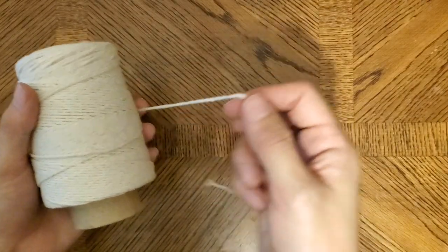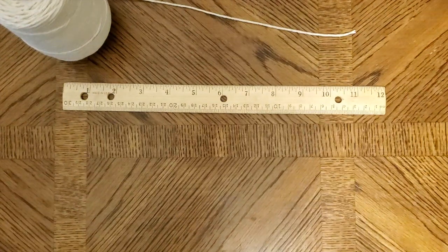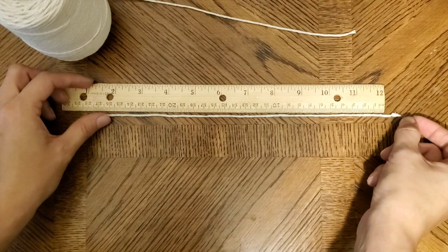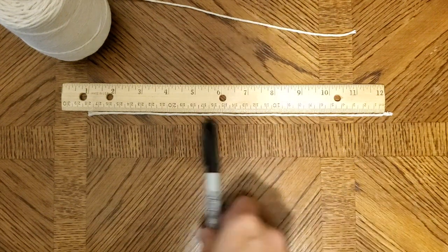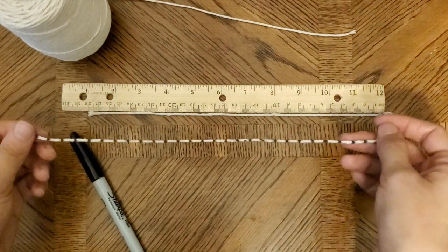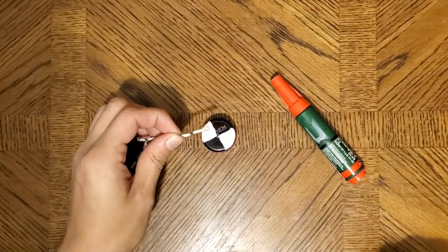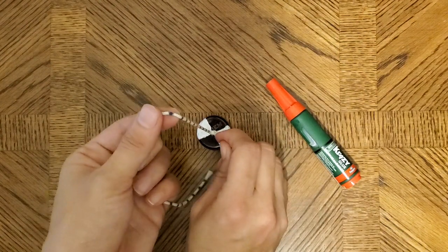Make sure that you ask an adult to help you with the gluing and that you're very careful. While the glue is drying, cut your string to be 12 inches long. Then tie a knot in one end of the string and lay your string down next to the ruler on the centimeter side. Use your Sharpie to mark off each centimeter from the knot all the way down to the end of the string.